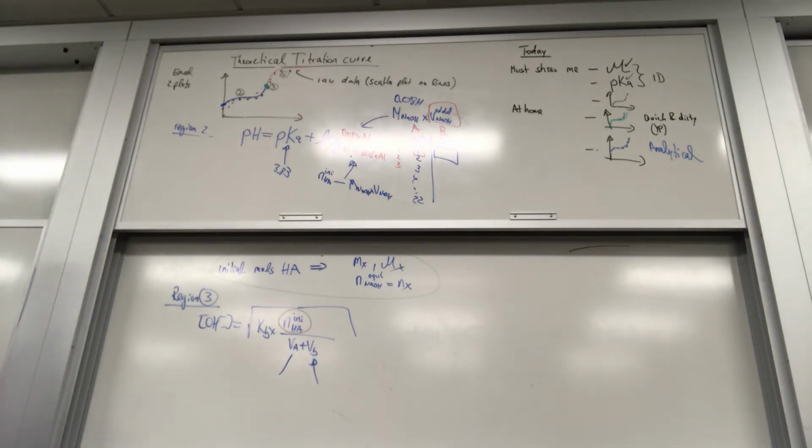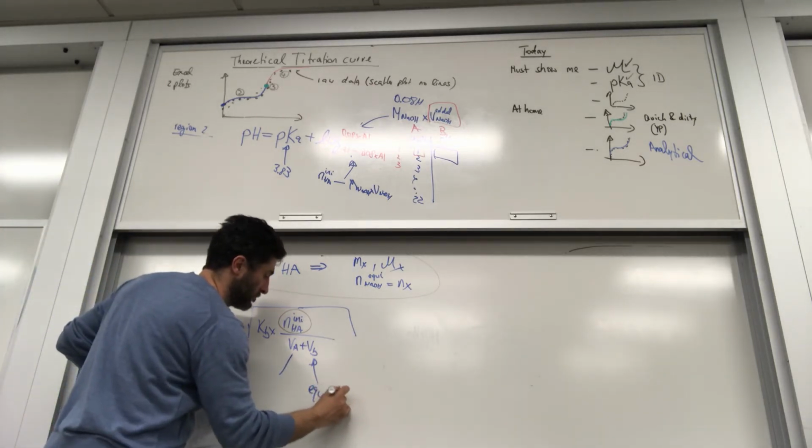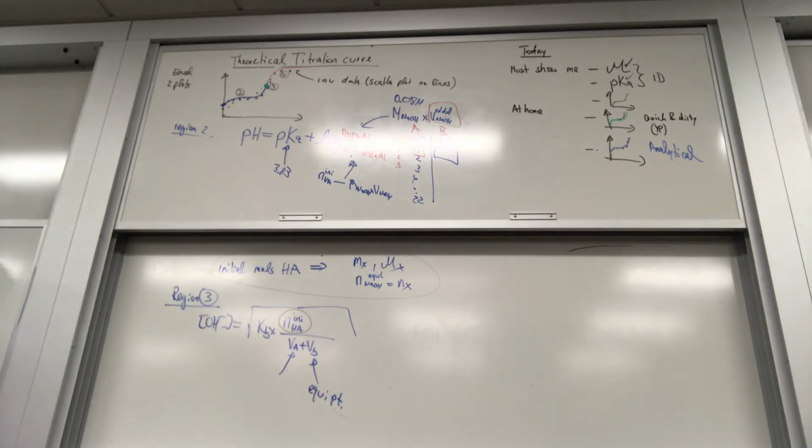What is the volume of base in my example? That was like 25.86, right? The volume to equivalence point. What's the volume of the acid?